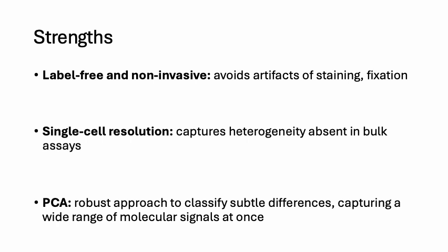Also, the paper demonstrated versatility by applying the method across the spectrum of cell lines, fully differentiated, partially differentiated, and truly pluripotent, which validated that the approach is not limited to a single cell type or narrow conditions. And all taken together, these attributes really show how Raman plus PCA can serve as a reliable live cell assay for monitoring progression in real time.